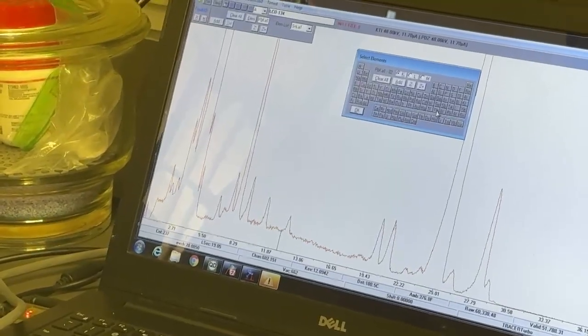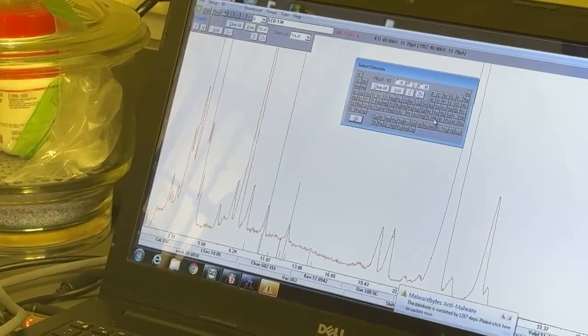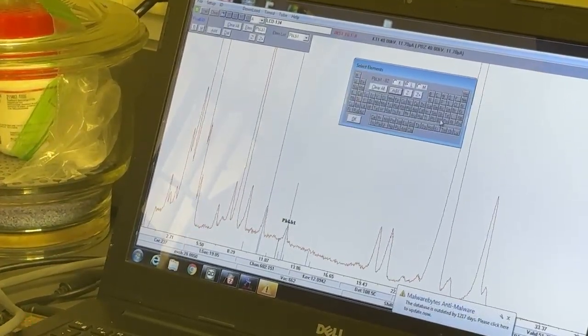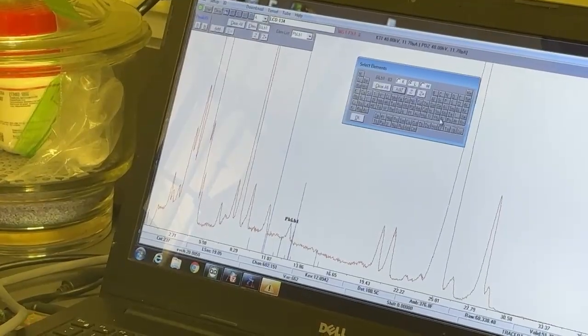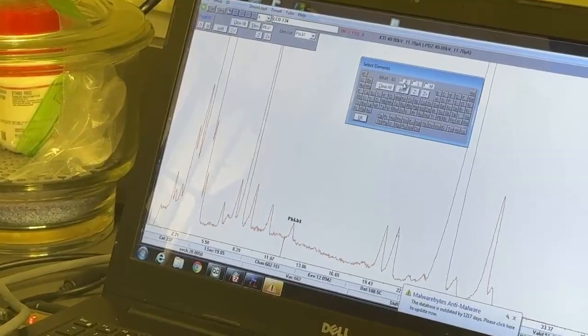Okay, and what about bismuth? We'll check this. And then we can remove bismuth. No bismuth. All right, well, Google thinks pewter has bismuth, but not this pewter. This pewter has copper, tin, and lead. There would be some more minor elements, but that's basically it.